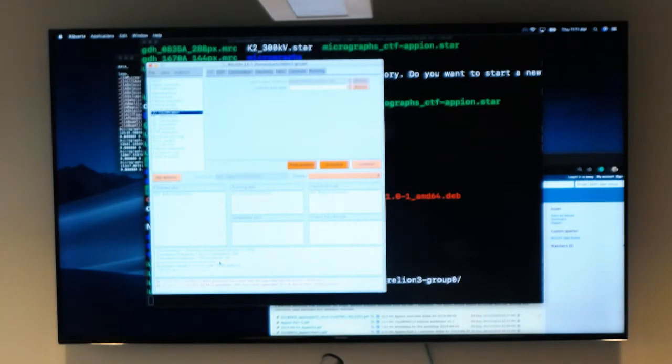How's our load? How's our AWS load? The load is normal. Okay, measure the window. We just physically type in there, microcloud. So we can say it's about the browser, maybe the network connections, because I think we are only using one.